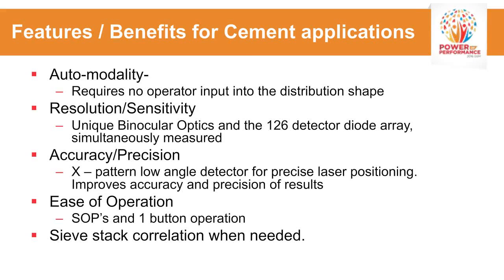So, some key features of the LS that one wants to consider, and these are, of course, benefits for cement applications. I mentioned earlier, for complex distributions, not wanting to have to input information about distribution shape. We usually don't know this prior to analyzing the sample.